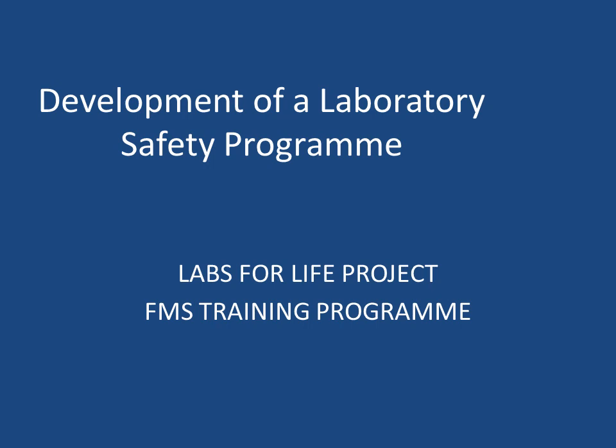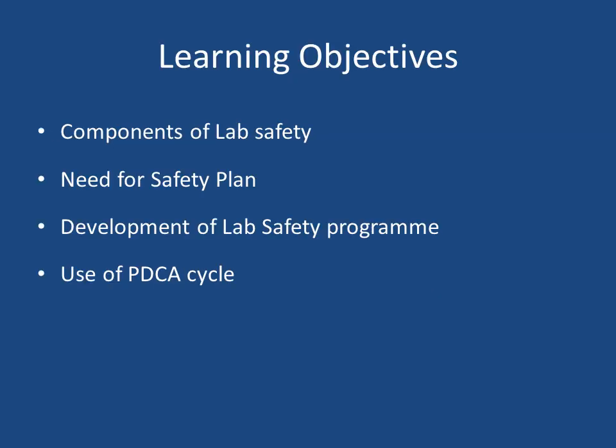Development of a laboratory safety program. In this presentation, we will briefly consider how a safety program should be put in place in a healthcare facility. The learning objectives of the presentation include the components of a laboratory safety program, why do we need a safety program, how do we develop one, and the use of the PDCA cycle in developing the safety program.